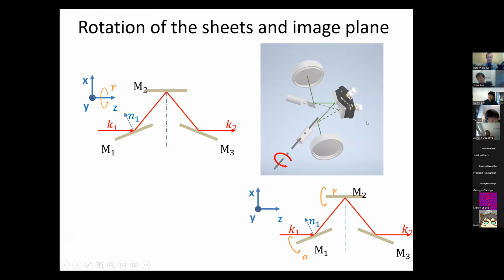So the idea was, very naively at first, proposed that we could essentially replace these 2 mirrors with scanning mirrors, galvo mirrors. And instead of having a mirror here that rotates, we could have 2 or 3 or more static mirrors at different rotation angles. With the galvos, we would select which mirror the light goes to, and as such, we could create discrete rotation angles. That looked very straightforward on paper, but was also very wrong.